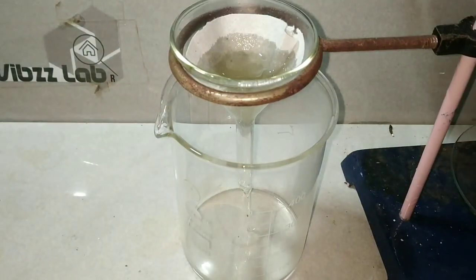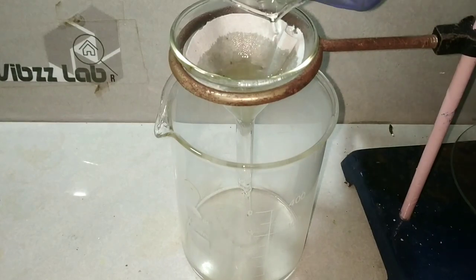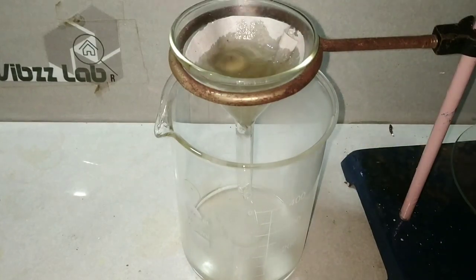I am using a simple gravity filtration here. The filtrate is actually the sodium potassium tartarate in solution.